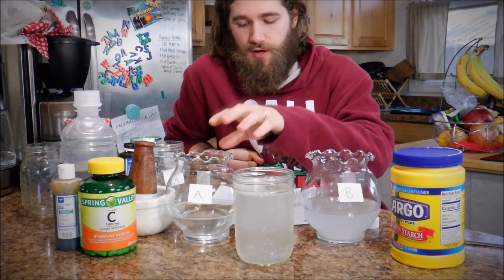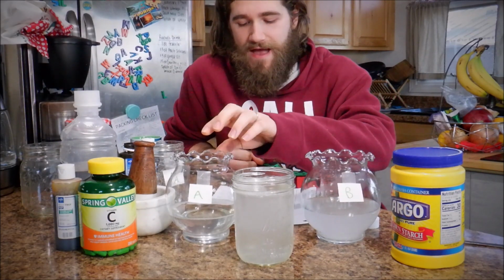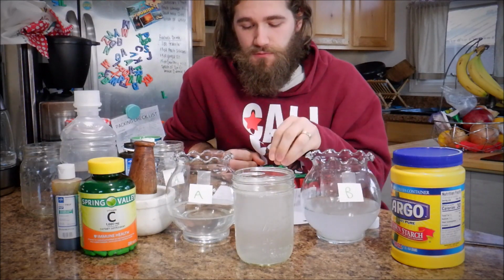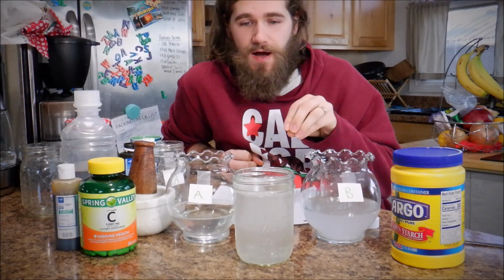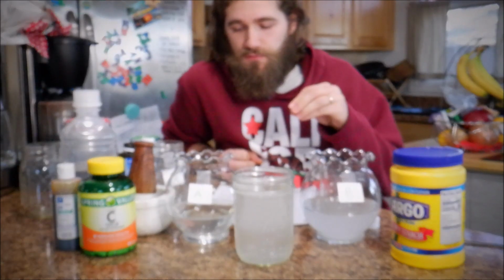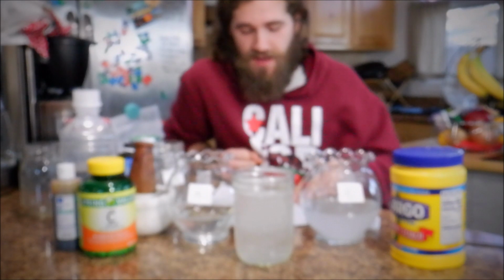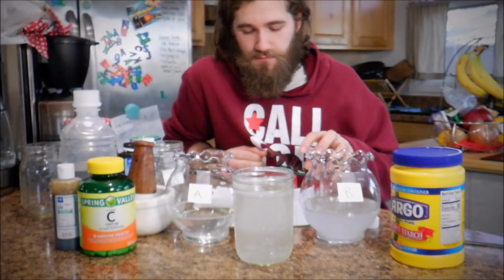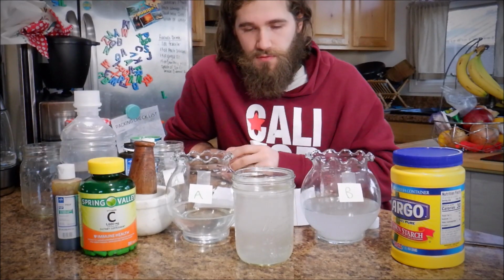But the ascorbic acid, vitamin C, wants to reduce that I2 back to I negative. So from the colored iodine to iodide, which is the I negative. This doesn't really last too long, so hopefully we'll see that here quickly.